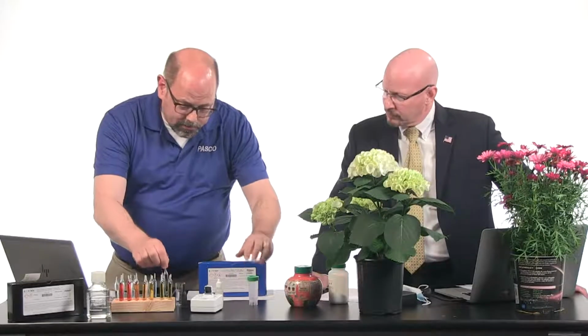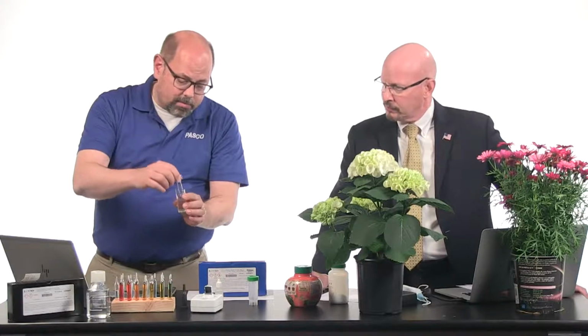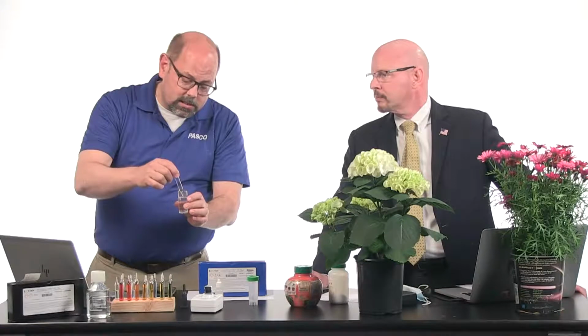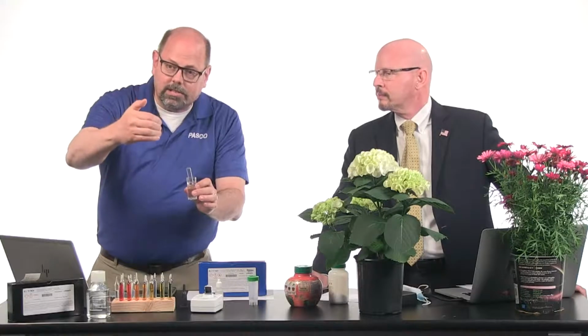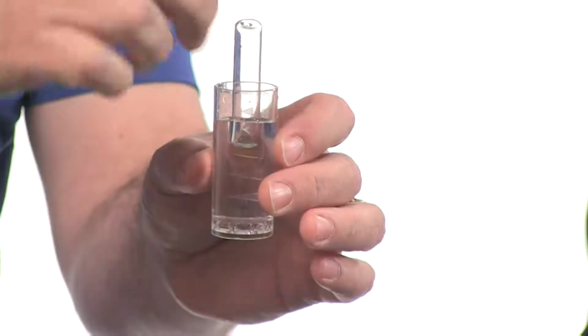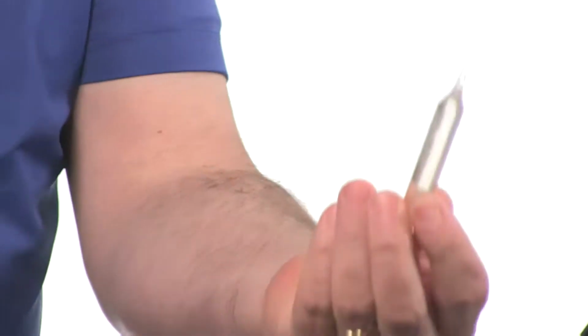Okay, now those have completely been mixed in, and it's at the bottom. As a matter of fact, if you want, you can stir that up just to make sure they're nicely mixed. This has got a very sensitive, sort of fragile glass tip, and at the bottom there's little curved scalloped edges on that. And so I'm just going to put them into that little scallop, or that little half circle, as you can see with that shot there. And I'm just going to grab the top and pull it towards myself. So let's go ahead and pull that in. It will bring in the amount of water that's necessary.